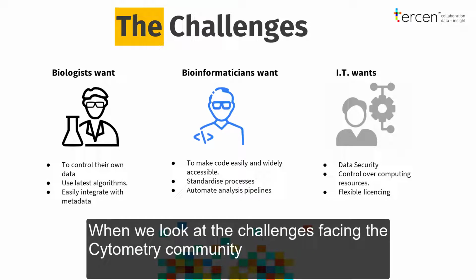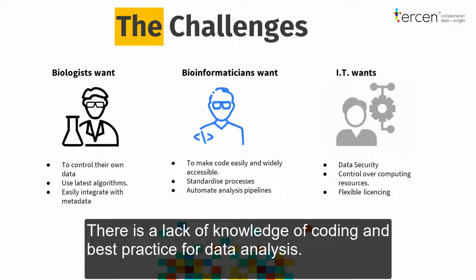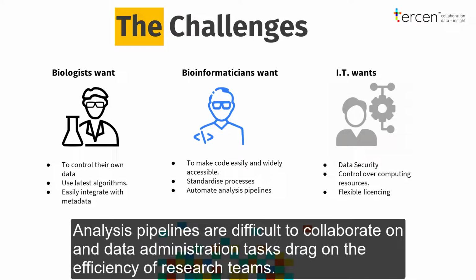When we look at the challenges facing the cytometry community, we see a vista where algorithms are underutilized. There is a lack of knowledge of coding and best practice for data analysis. Analysis pipelines are difficult to collaborate on, and data administration tasks drag on the efficiency of research teams.